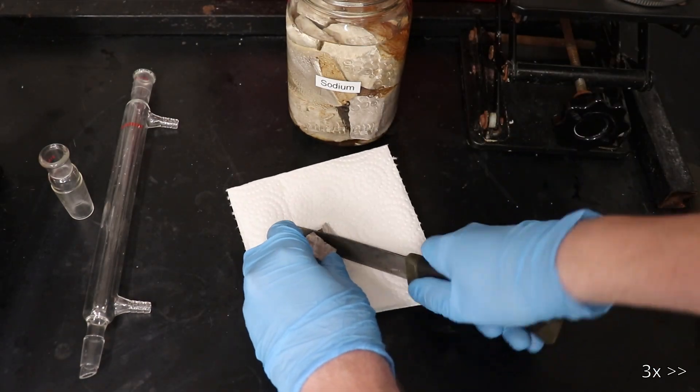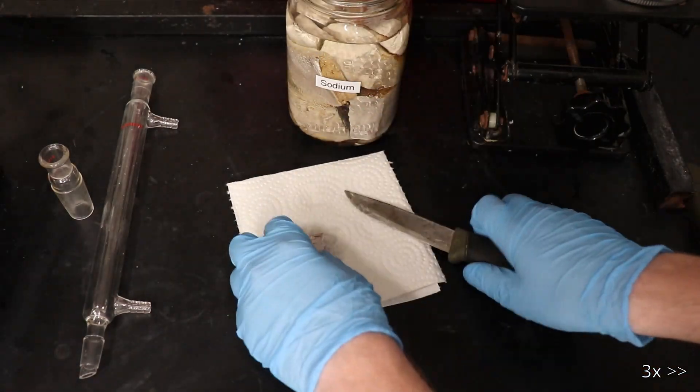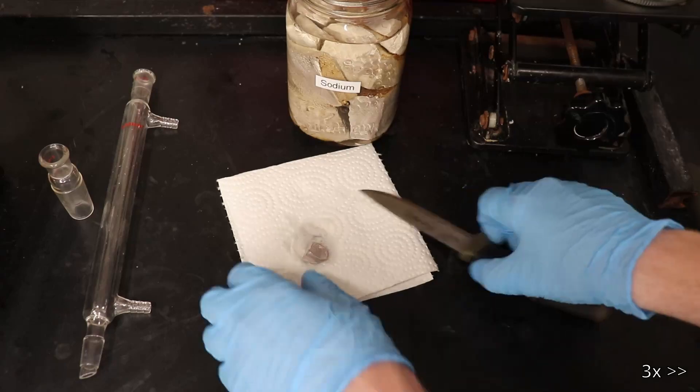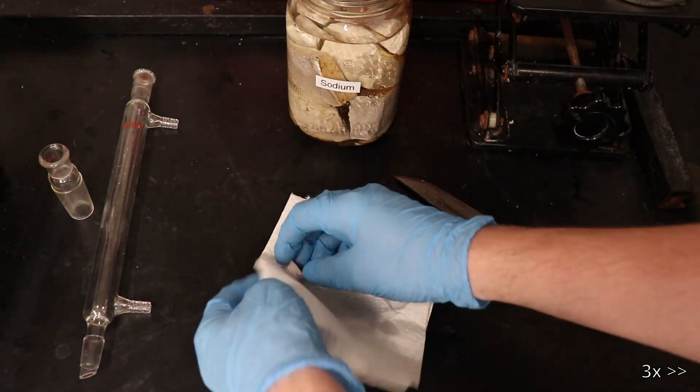To further dry the morpholine, about a one gram piece of sodium metal is chopped up into pieces and added, and was then refluxed for one hour.